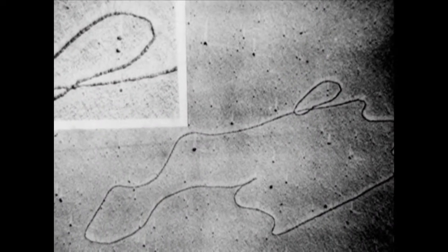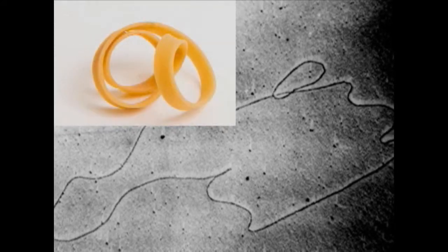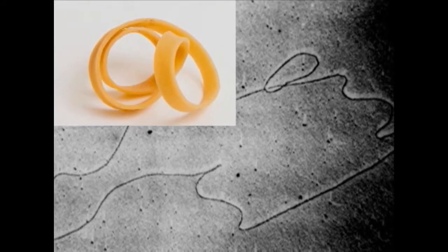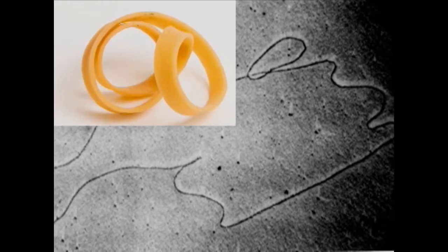Plasmids are circular chains, but are normally found in a supercoiled state, like a rubber band that's been twisted until it coils itself into a little ball. Because supercoiled DNA is so tightly twisted, the alkaline solution won't break it down.